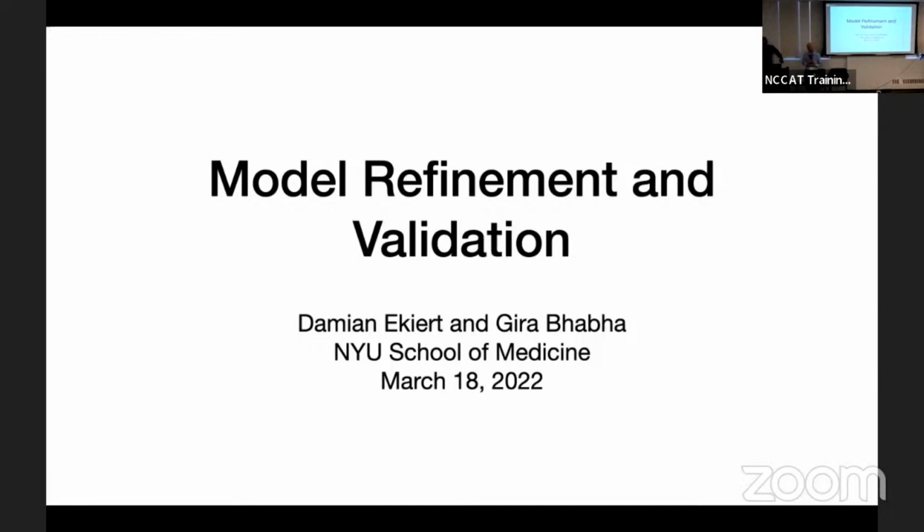And I think the main thing to think about is what are we going to do with maps now that we're in structural biology, where we were sort of technologists and sort of biologists coming at the issue. It's not that we skipped model building, it's just that until recently, we didn't have the Coulomb potential maps that we would want to make those testable models.